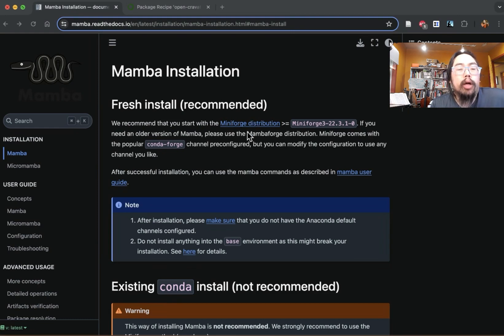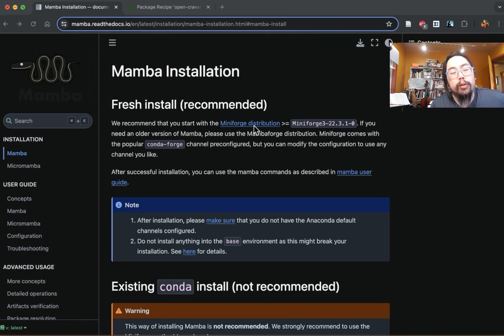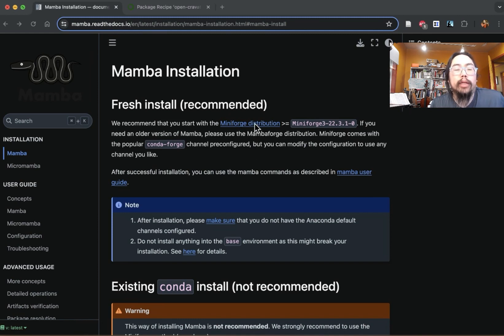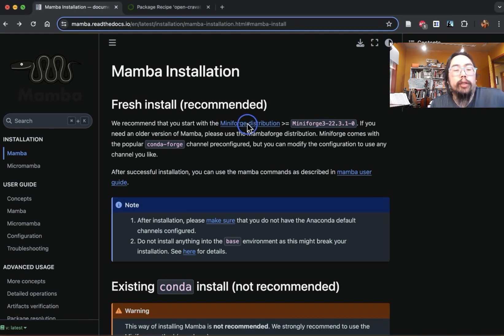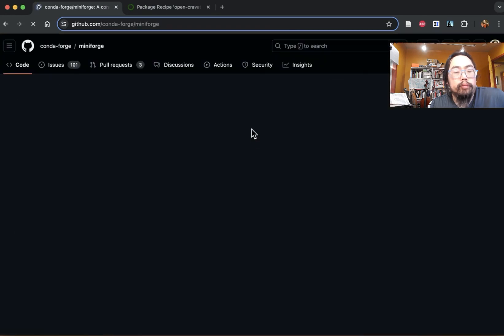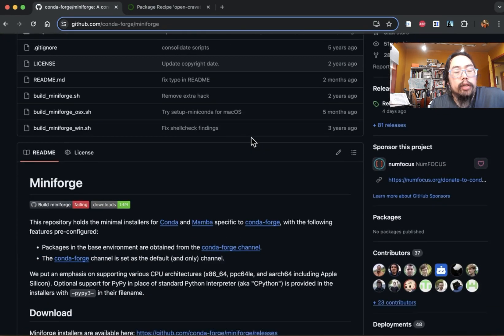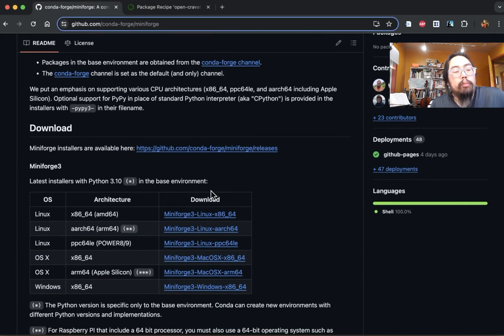So if you're on the Mamba installation page, you'll see that there is this link to the distribution. So confusingly, Mamba is bundled with Conda and MiniForge. So we want to click on MiniForge. And there are some pre-made installers here, so you can download them for your particular platform of interest.